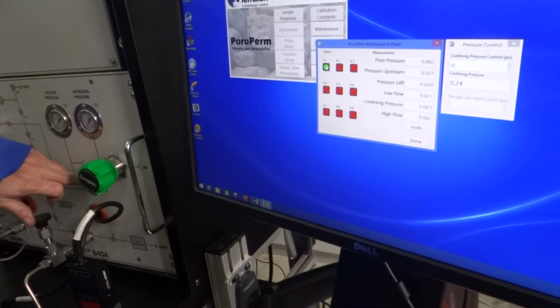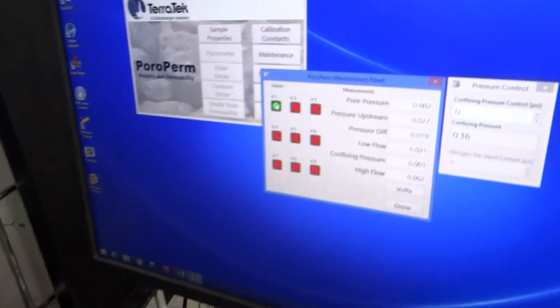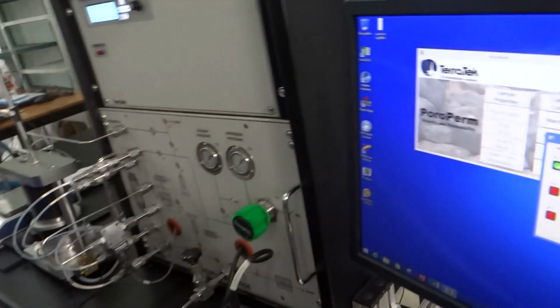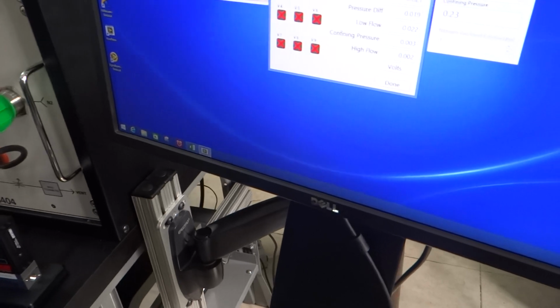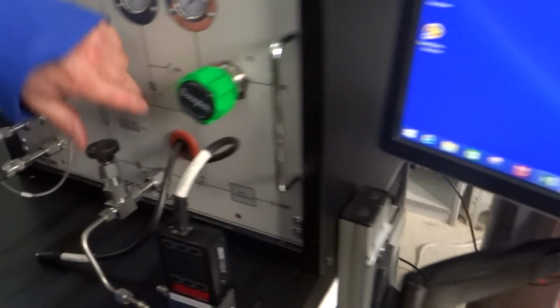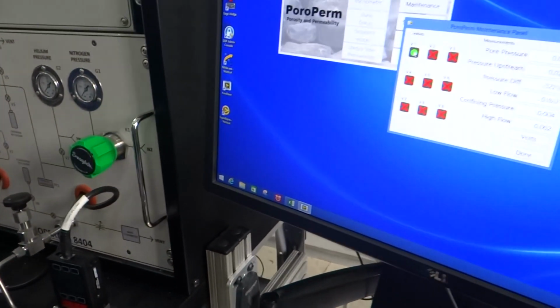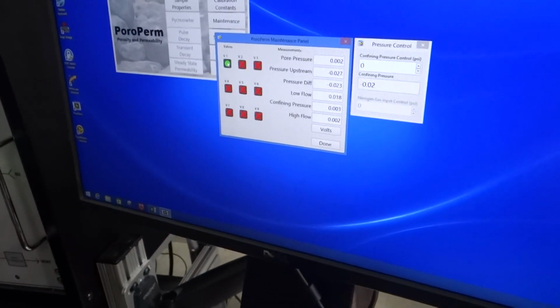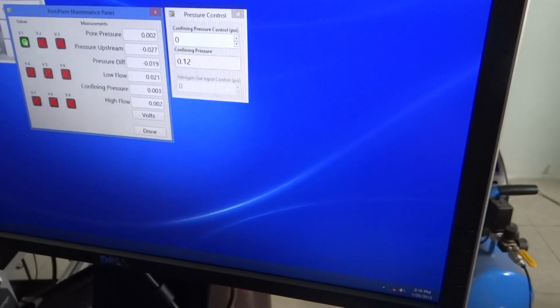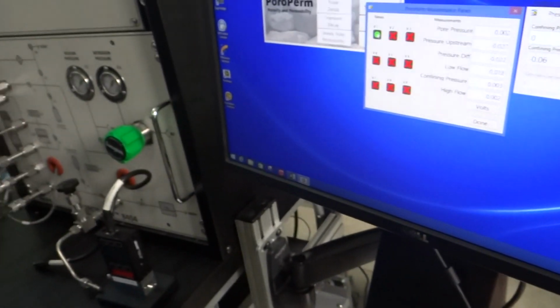So you just open this now, open this, yes. Open the screen. You won't see anything over here, but you just know that it's open. Yeah, this means this valve is open. Right. Okay. And the same with each of the others. So this gives you a way to cycle the valves.